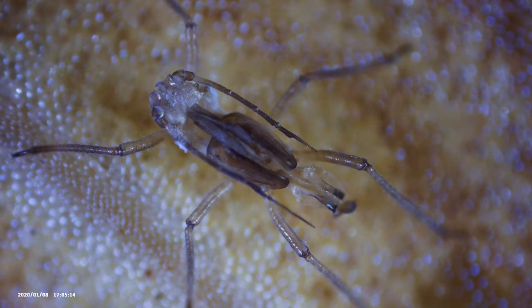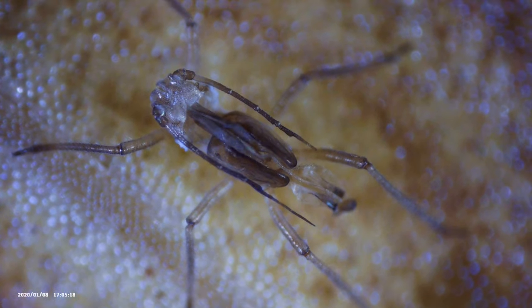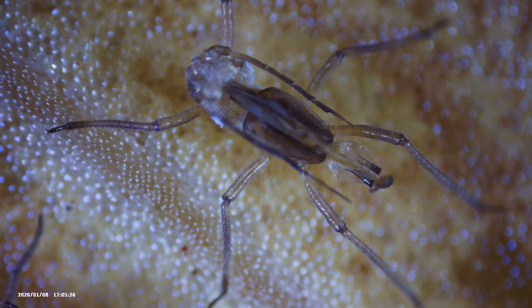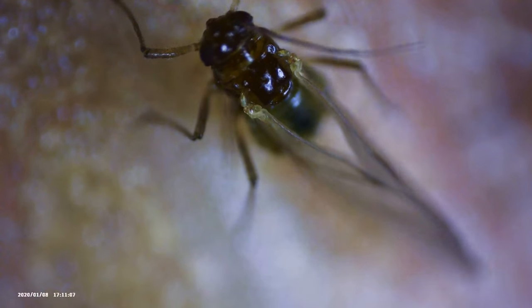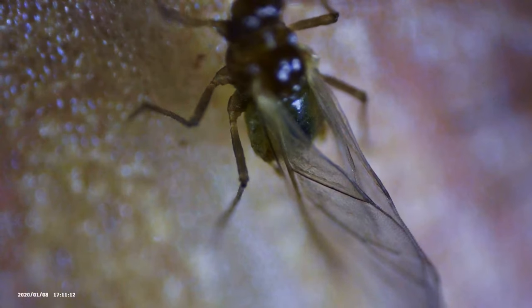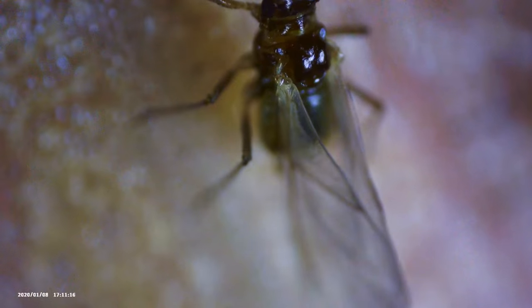Aphids, like most other pests, have several forms — from egg to nymph, and I believe a larva phase as well. What a lot of people don't realize is aphids do have a final form with wings, and that's how they're able to spread so fast. I have a feeling that a lot of those exoskeletons we see are shed once they get their wings — after that they fly to another plant and spread quite quickly.